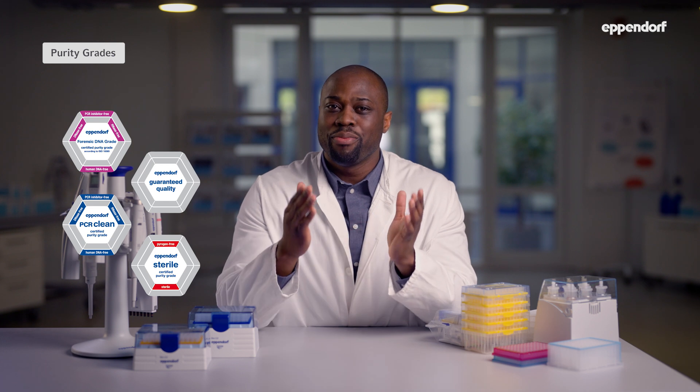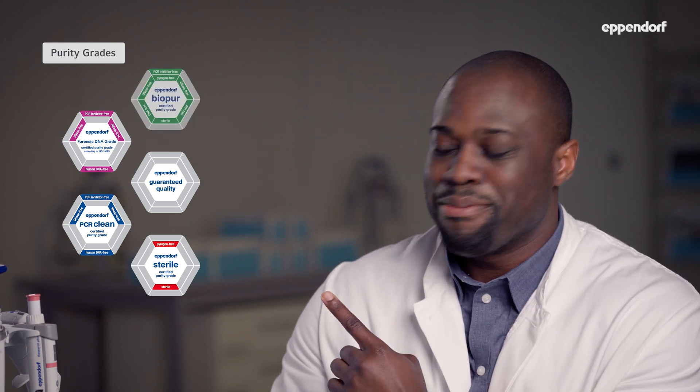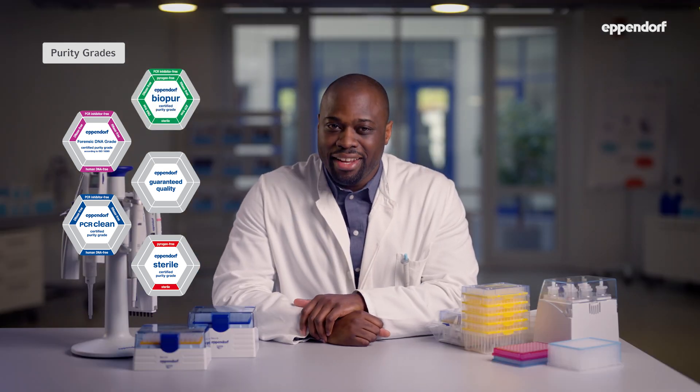Pipette tips are available in several purity grades suited for any task in today's labs. Certified purity grades from Eppendorf are tailored to individual application needs. Eppendorf Quality are premium lab consumables meeting all criteria for standard lab applications — it is the basis on which all other purity grades are built. Sterile purity is typically used when working with live organisms like bacteria, yeast or cells. PCR Clean is ideal for working with PCR or any other applications using DNA or RNA samples. Forensic DNA grade tips are our second highest purity grade, certified for human DNA analysis according to ISO 18385. The highest purity grade Eppendorf offers is Biopure, suitable for almost any method and application.